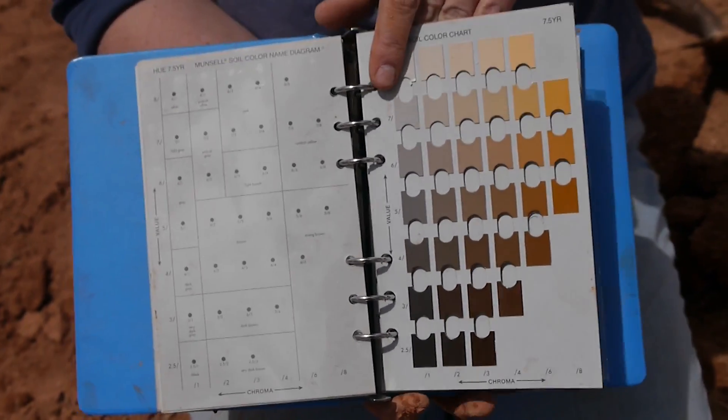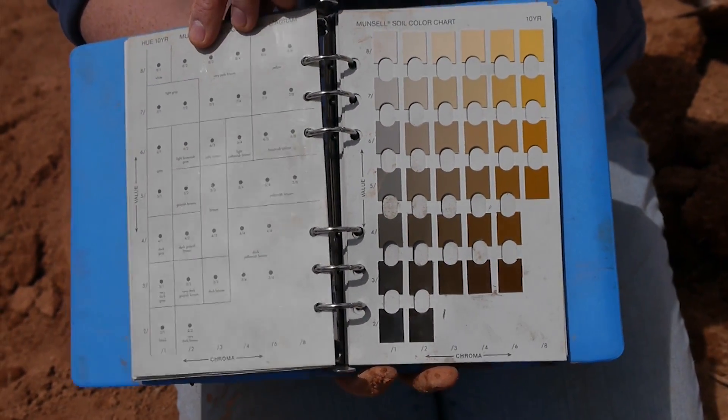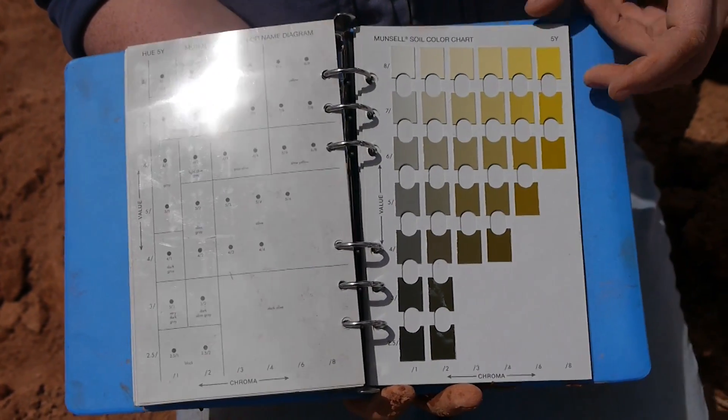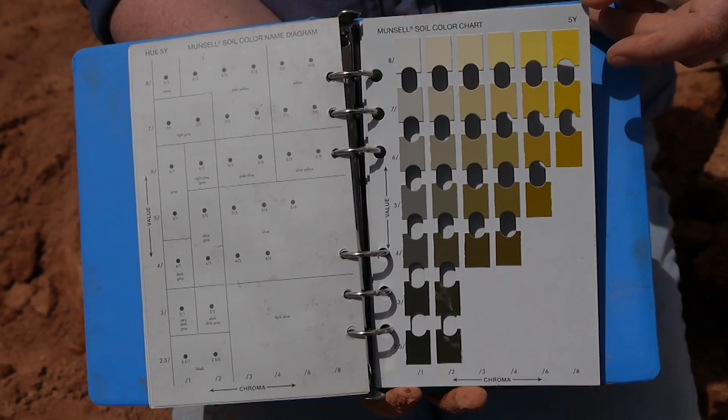As I'm turning the pages, it was really red to start with, but it's getting to be a little more yellow, and then all the way in the back it's getting really yellow — almost greenish colors. This is one way to orient yourself to which color page you should be on.